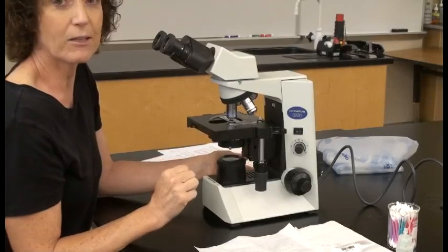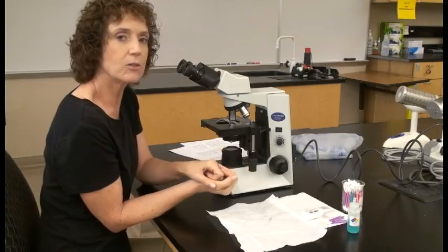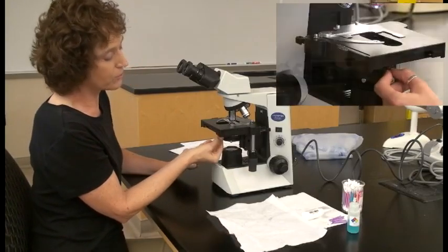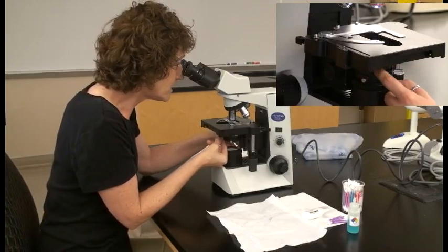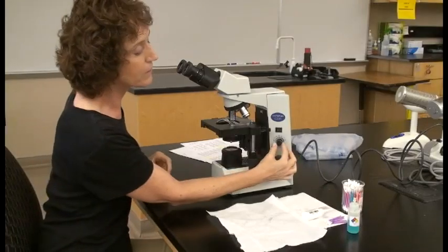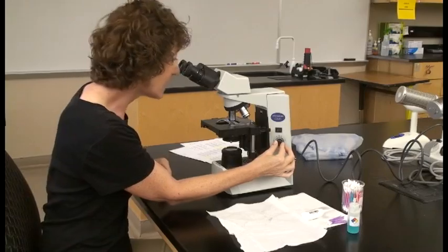When you increase the magnification, two things happen: your field of view decreases and the light decreases. You may want to increase the intensity of light in two ways. You can maneuver the iris diaphragm lever to open it up a bit, or you can use the rheostat to increase the light intensity.